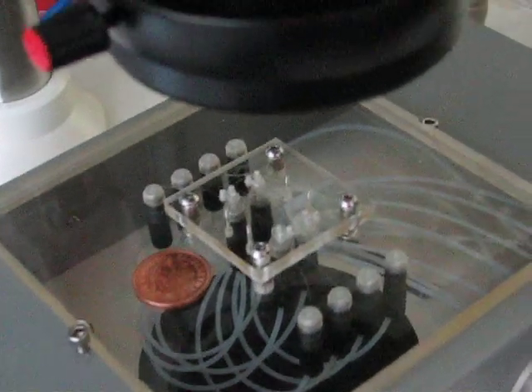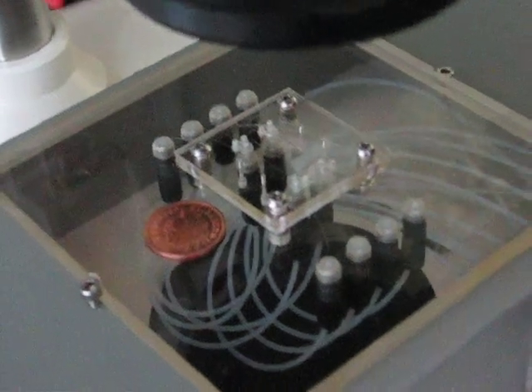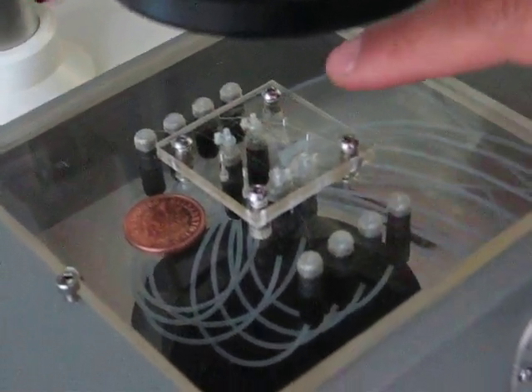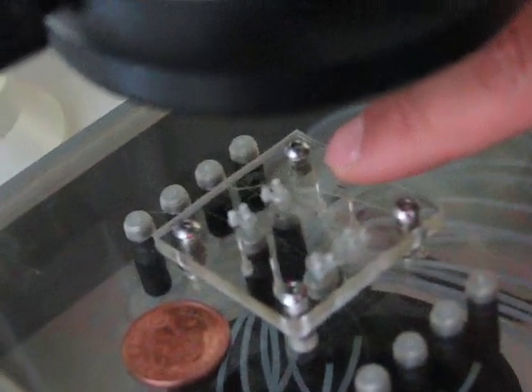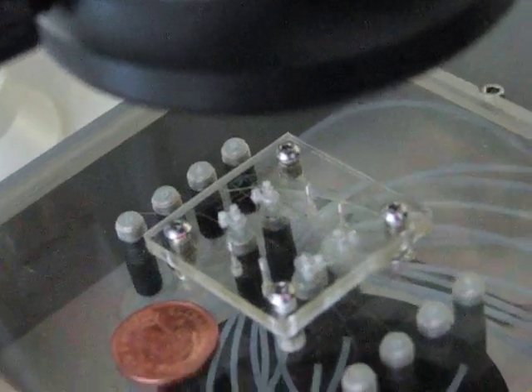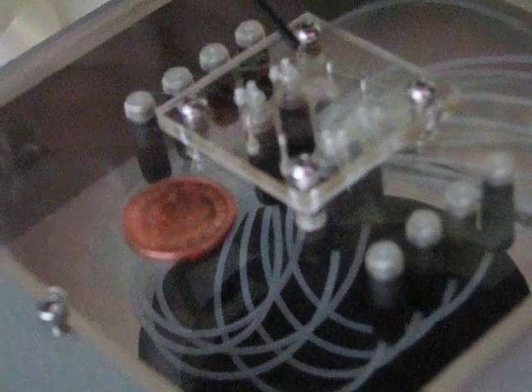So, great. And can you just, with your finger, with the key, show us where the circuit actually is on the... You can see here. You zoom in a little bit. Yeah. This is where we trap the bubbles we generated. But you won't be able to see the chamber in the white area. But if you could take the key and just tell us the length of the actual circuit. Just demonstrate with the key.